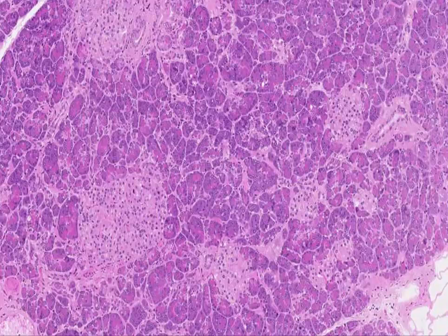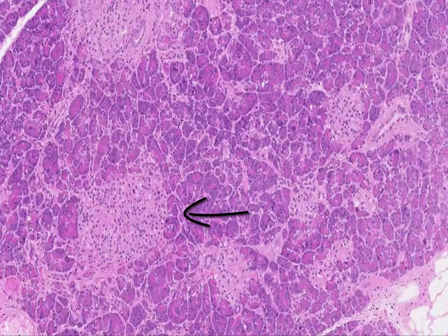The majority of the pancreas is composed of acinar cells, which comprise the exocrine pancreas. The endocrine functioning islets of Langerhans confirm that we are looking at the pancreas and not the parotid, which lacks endocrine function.